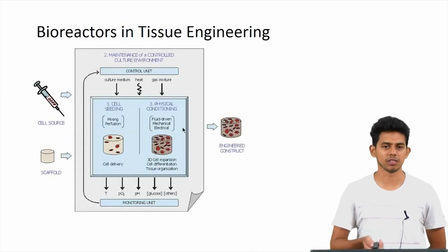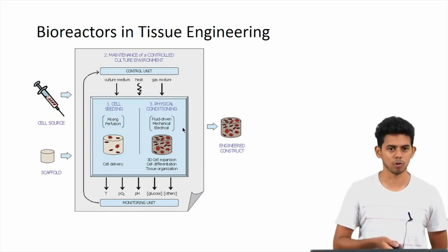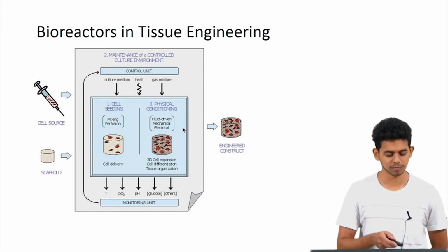Now looking at the main functions of a bioreactor in tissue engineering. So we have a cell source and a scaffold.